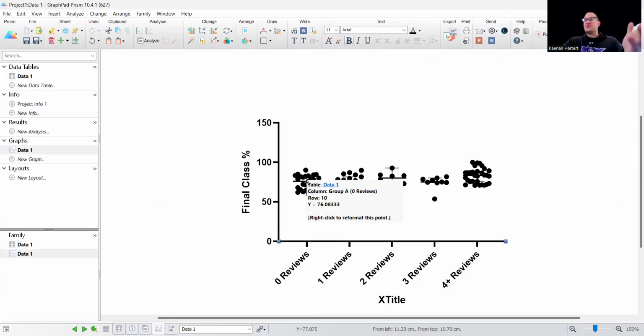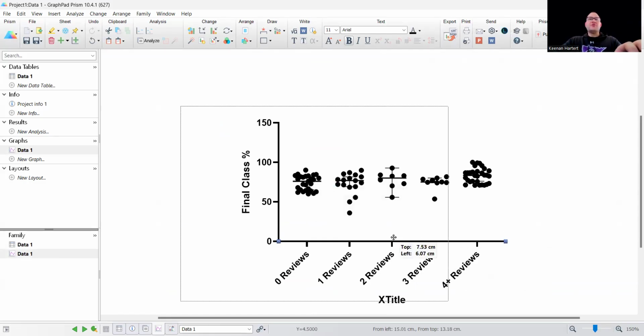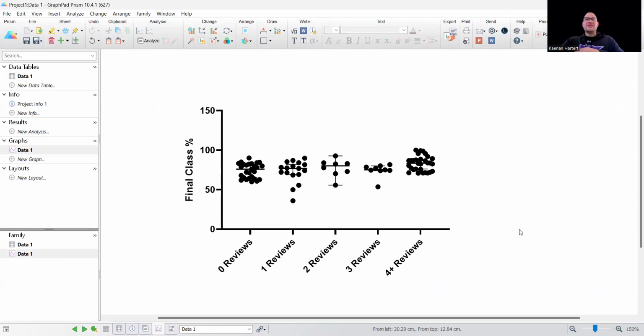So now in here on these data, obviously things are a little denser with the individual plots. I would maybe make those a little sharper in this case, but the key criteria of this video is how are we going to compare these multiple groups right here? So similar to the t-test, there is a shortcut for column data that will take you to ANOVAs right here. Again, you can also find this in the Analyze tab, but I'll go ahead and click right here.